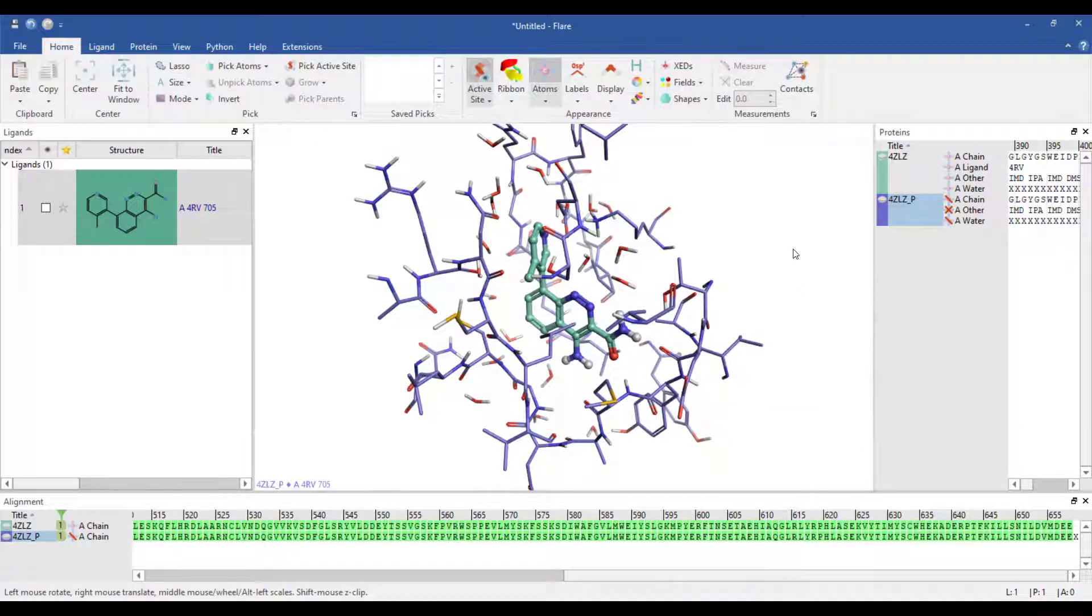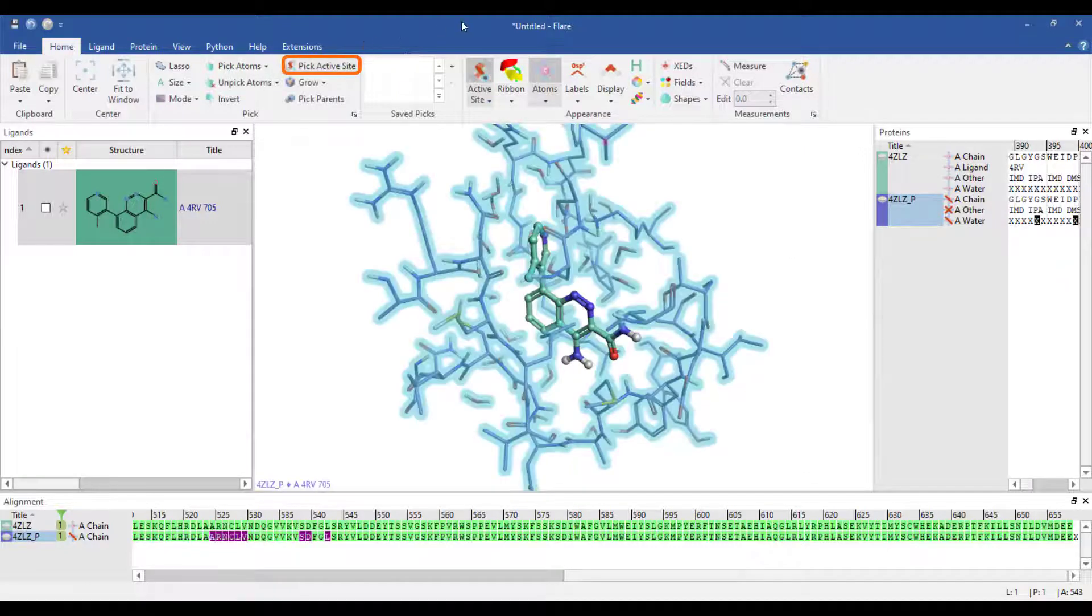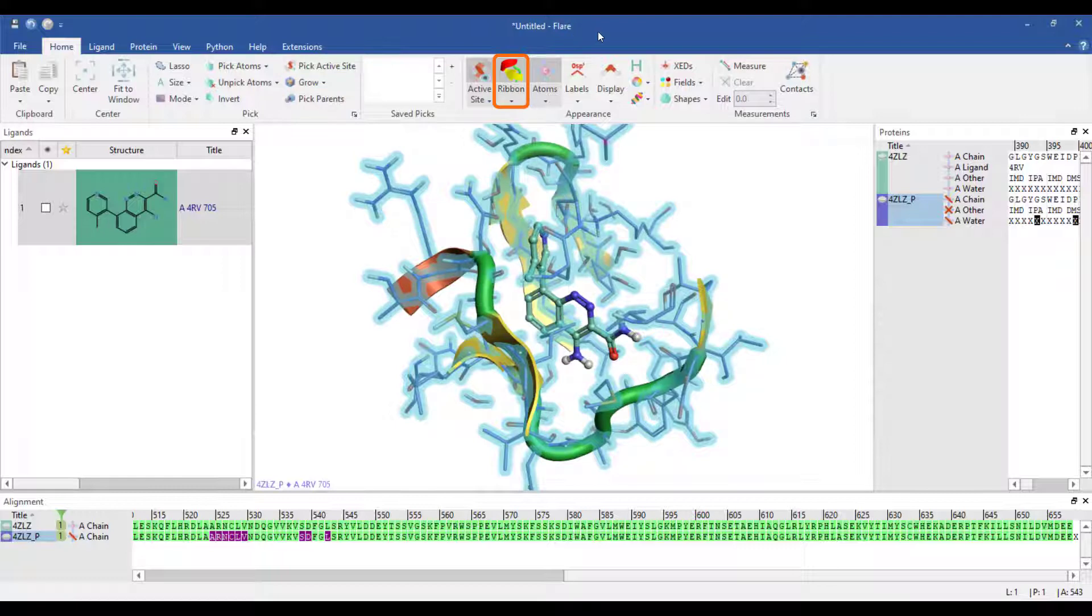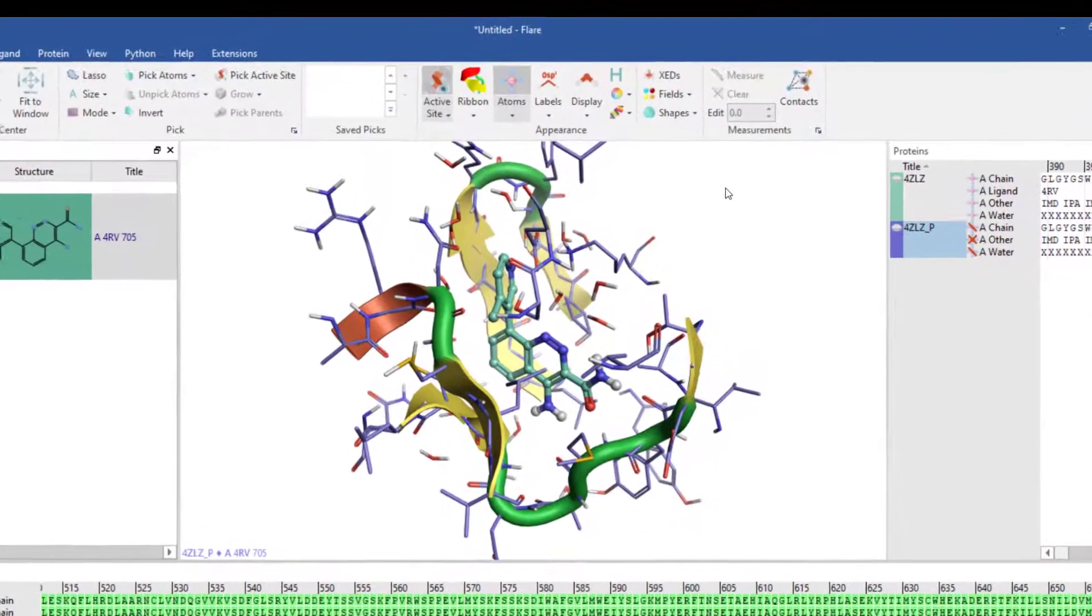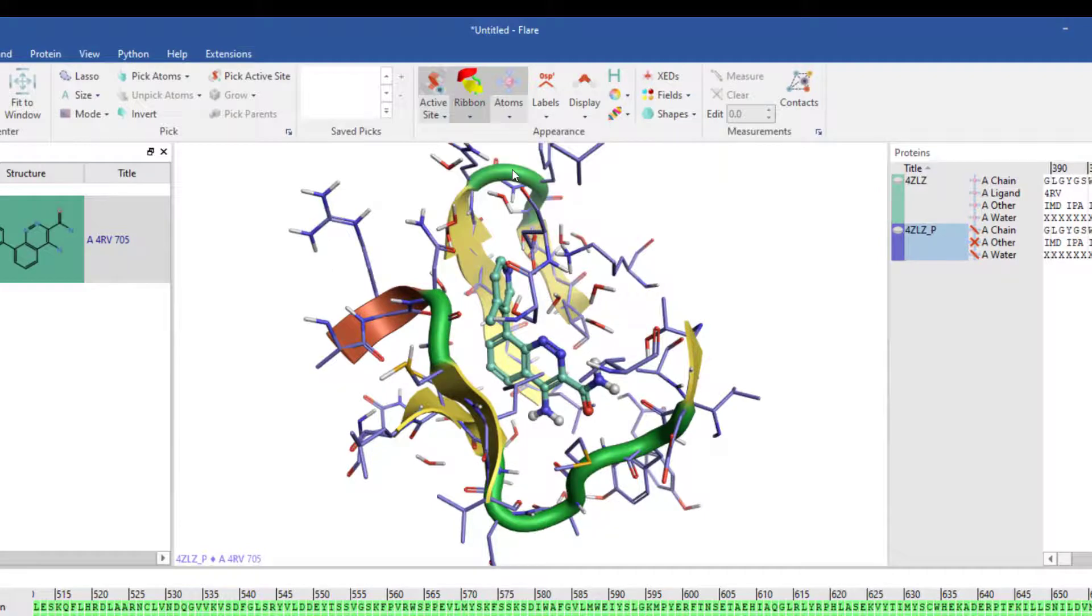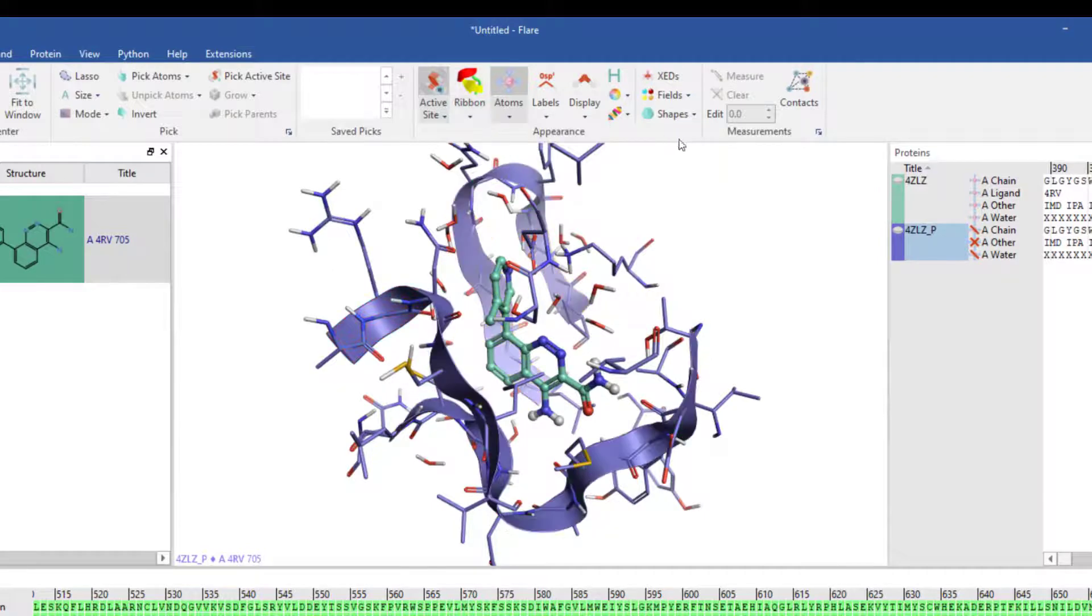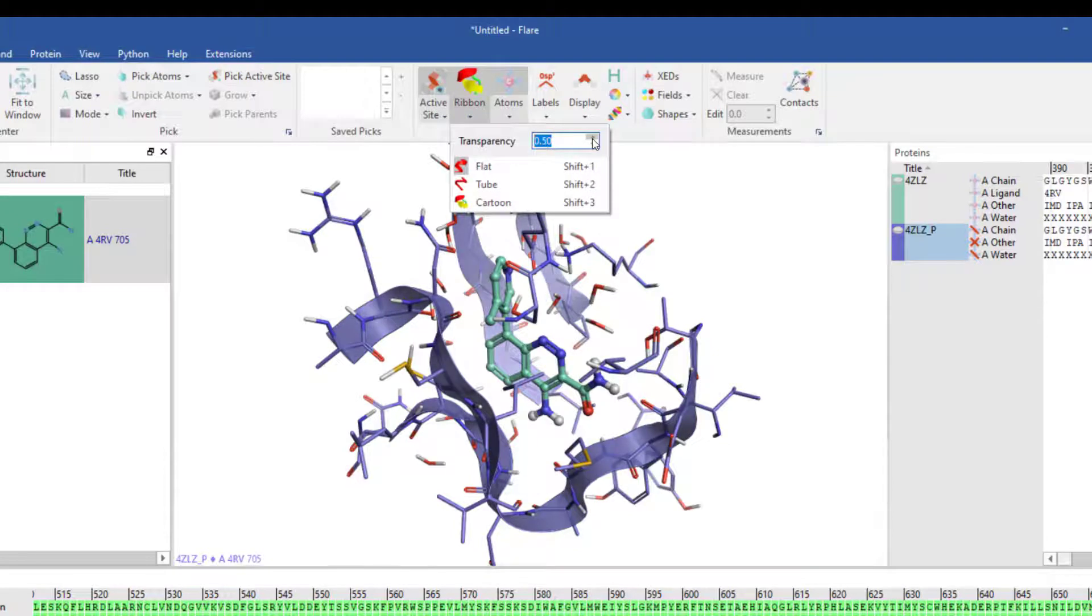The protein ribbon can be displayed for a user defined selection, for example residues that define the binding site, by picking the active site then turning the ribbon back on. I can change the ribbon's representation style to flat via the ribbon buttons pull down menu and increase its transparency to simplify the 3D view.